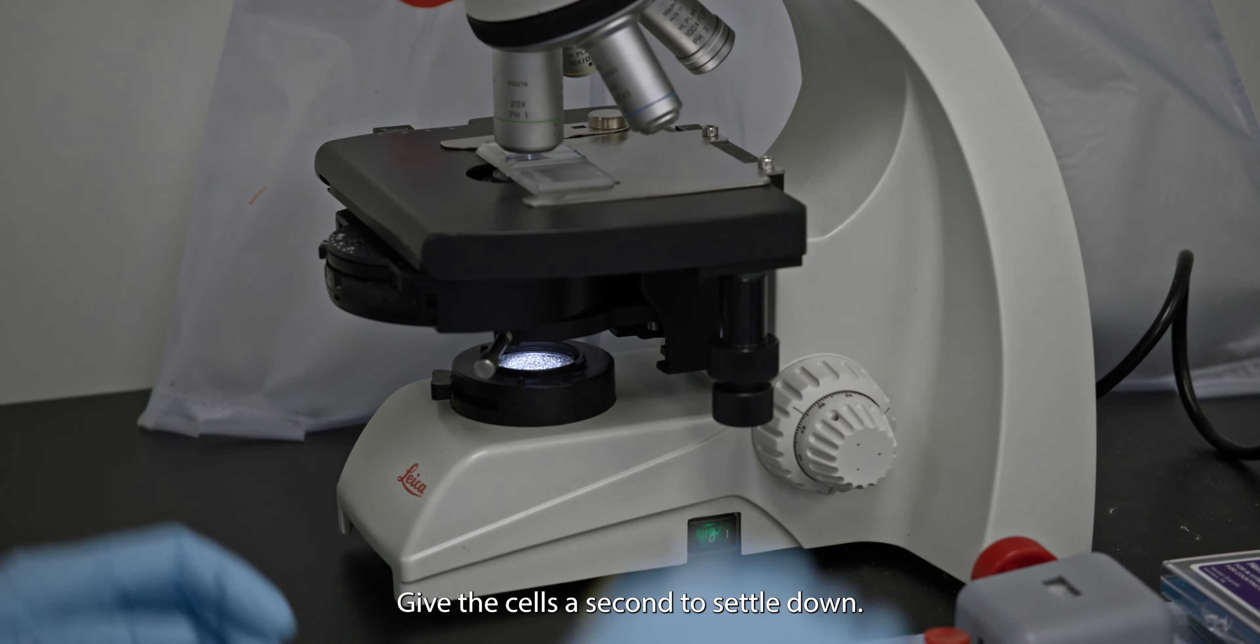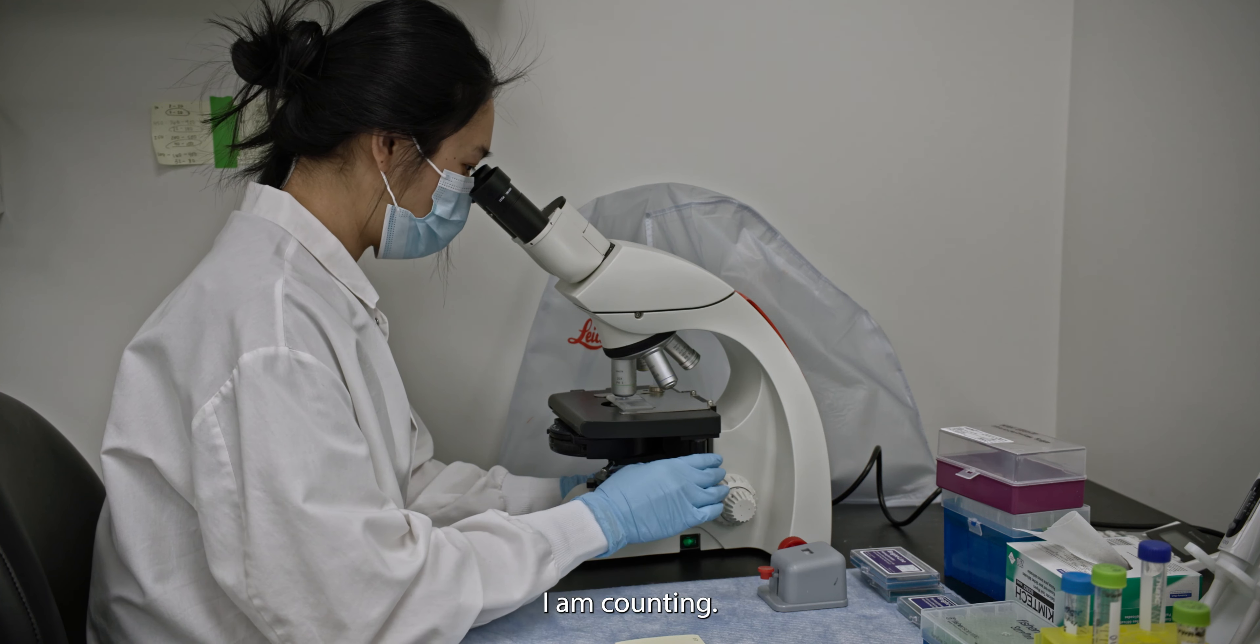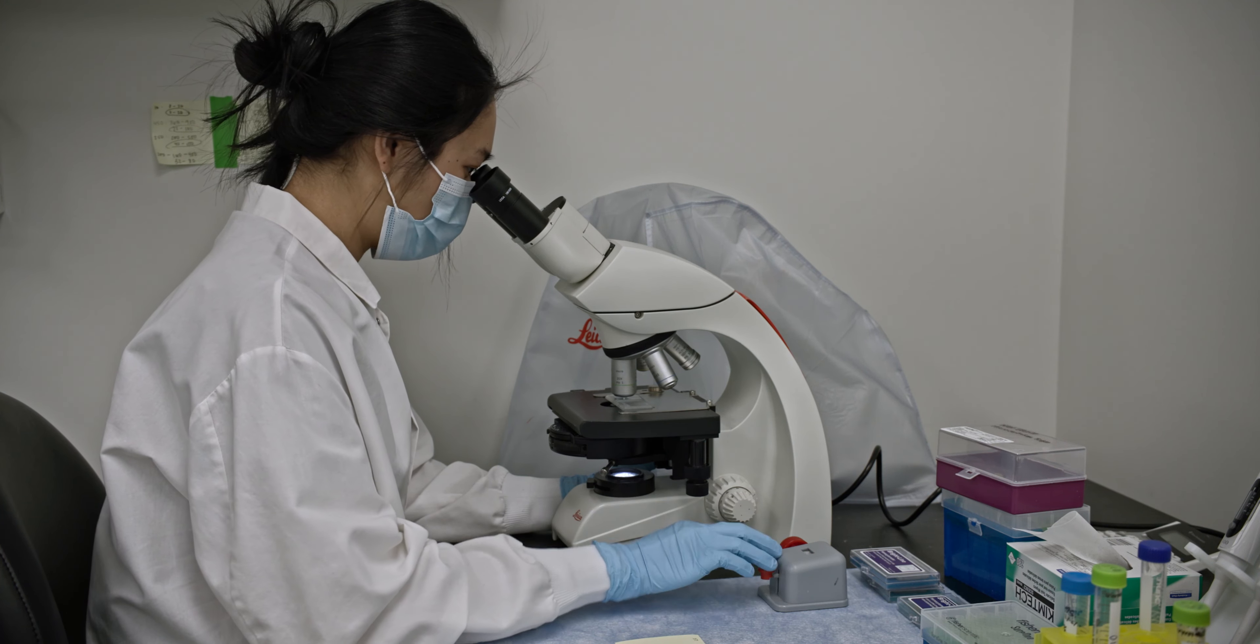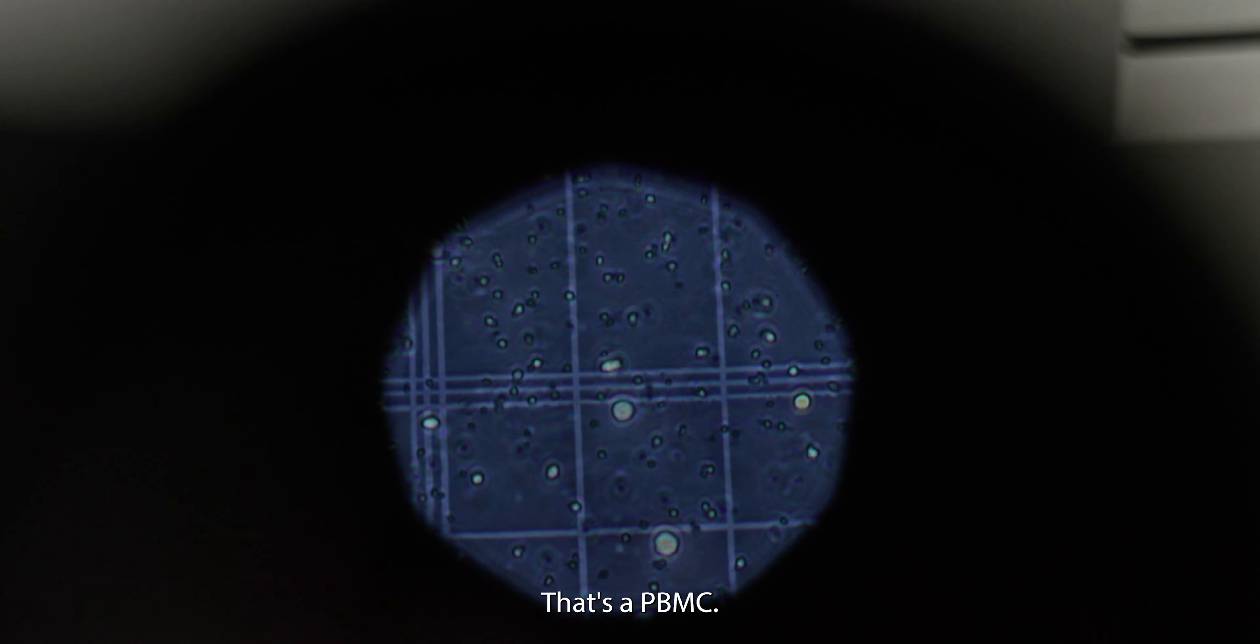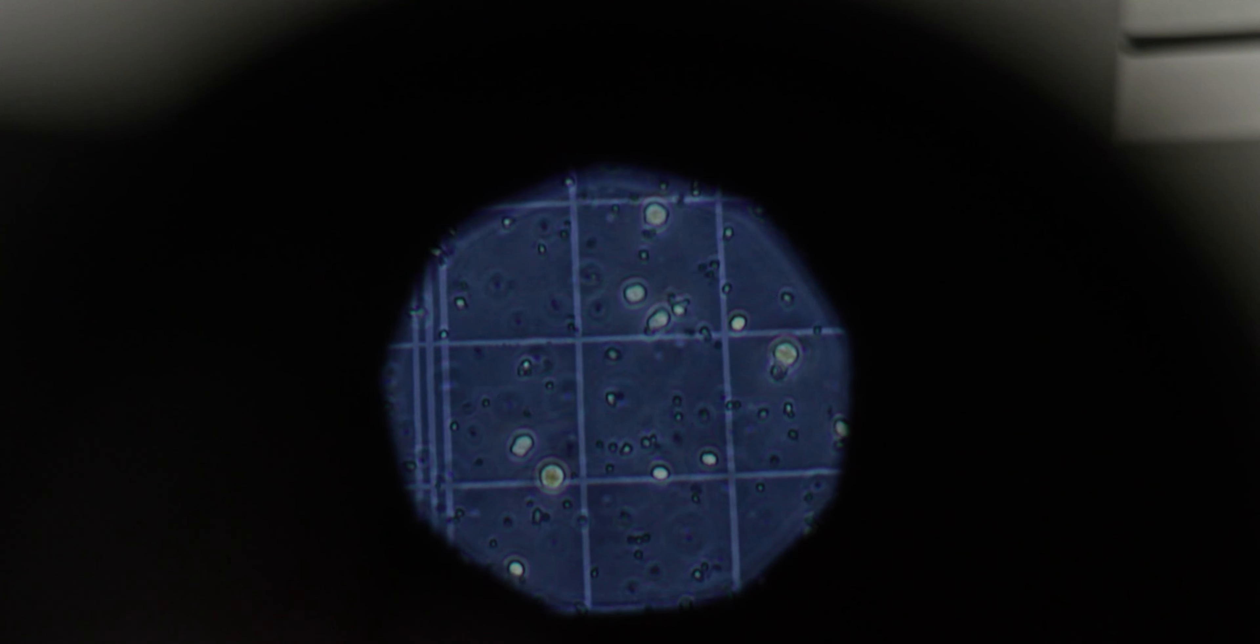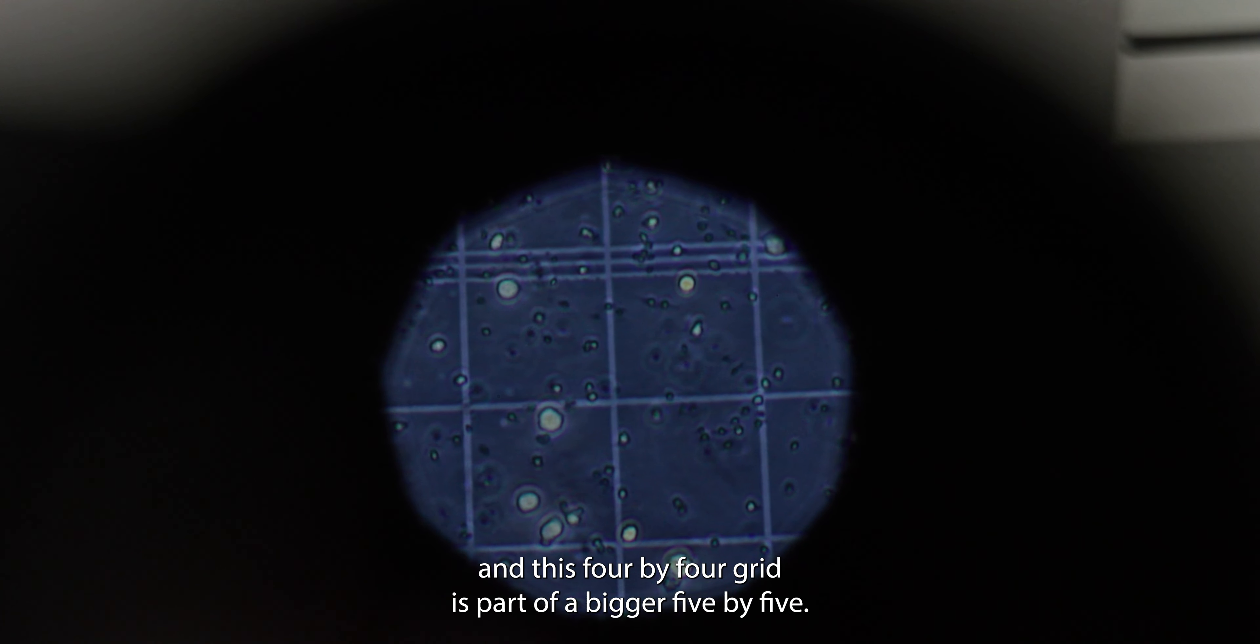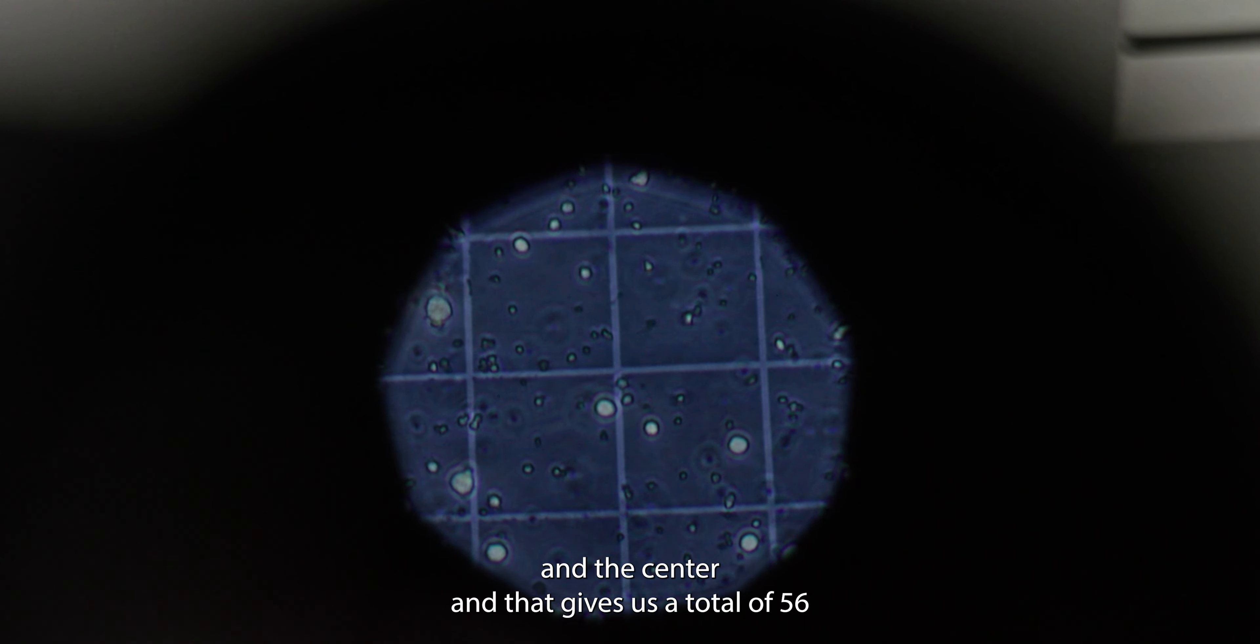So load that. Give the cells a second to settle down. They're still suspended in the liquid a bit. I am counting. Every time I see a cell, I tap it so I don't have to remember the number. So right there on that line is one of the cells that I would count. That's a PBMC. So that's one of the 56 that I counted earlier. And just go in this 4x4 grid and count everything in there. And this 4x4 grid is part of a bigger 5x5. So we go to the other corner of that 5x5 and count all 16. So we count each corner and the center. And that gives us a total of 56 cells.